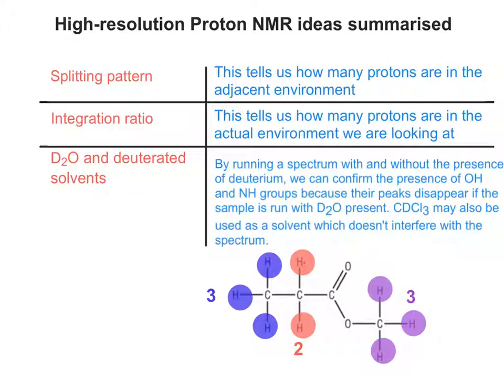So the integration ratio tells us how many protons are in the actual environment we're looking at. So it's a 3:2:3 ratio of the protons in the three different environments we've just looked at.